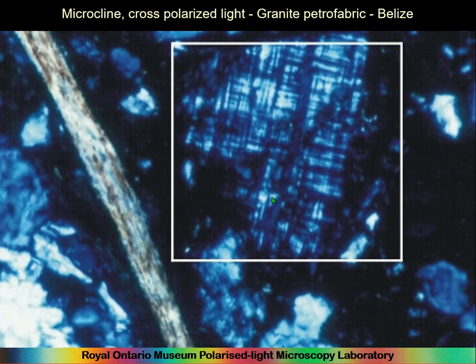And if they look like they're about the same size, worn down to about the same amount, you might hypothesize that they originally belonged together. And so if it turns out that it's equal amounts of potassic feldspar and quartz and plagioclase, you probably have a granitic rock.